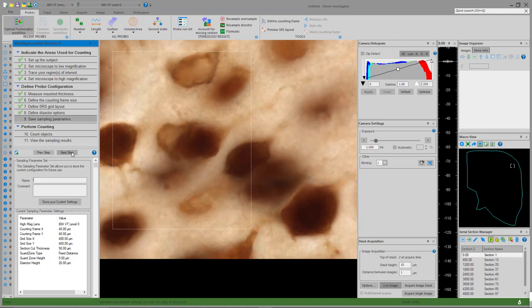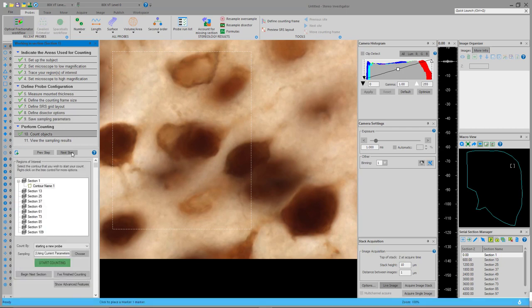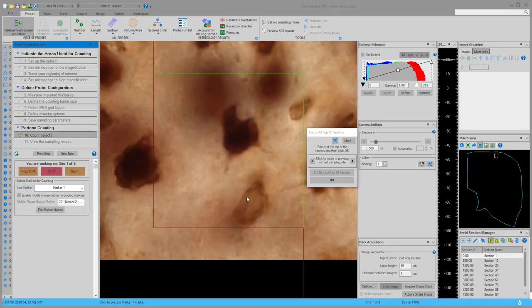On step 9, you can save those sampling parameters — a handy way to retrieve them later if your PI has questions, or to recycle them for another subject or experiment. Finally, on step 10, Count Objects, we'll hit the green Start Counting button. This is unfortunately the step you'll probably spend the most time on. We're now ready to begin counting cells — we'll start by focusing to the top and bottom of the tissue to measure its thickness.